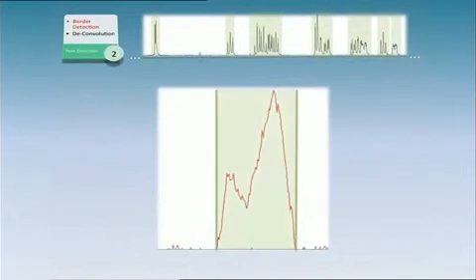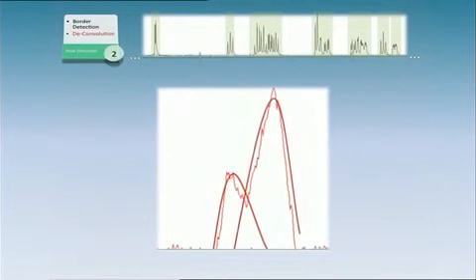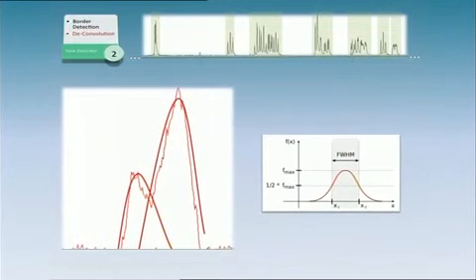To achieve this, potential start and endpoints are sought. In most situations, these peaks overlap. Therefore, their actual shape needs to be recovered. Once found, each single peak is analyzed and its properties such as position, height, and area are stored.